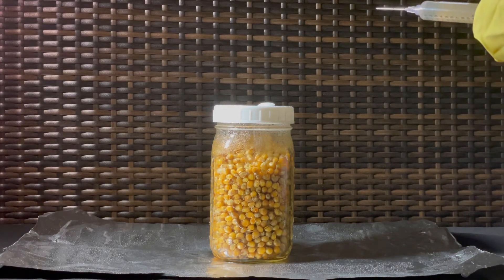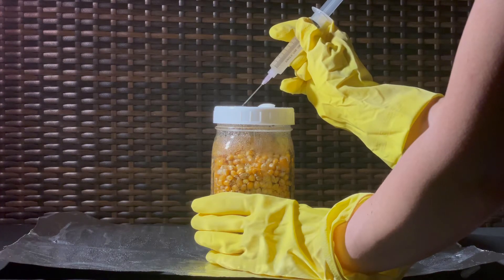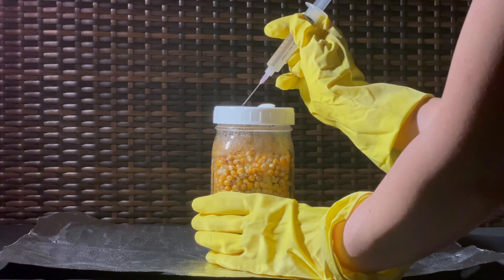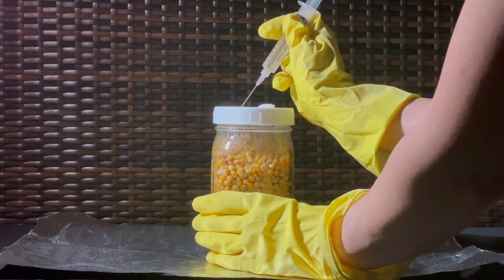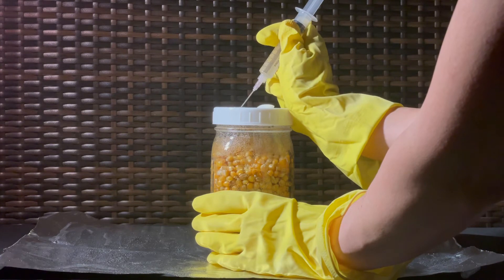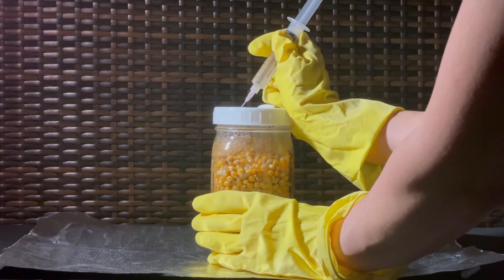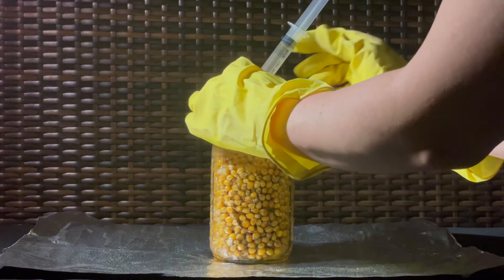Once that's done, inject 0.5 to 1cc of spore solution through the self-healing port of your jar. I've personally found that 0.5cc is more than enough for each jar.